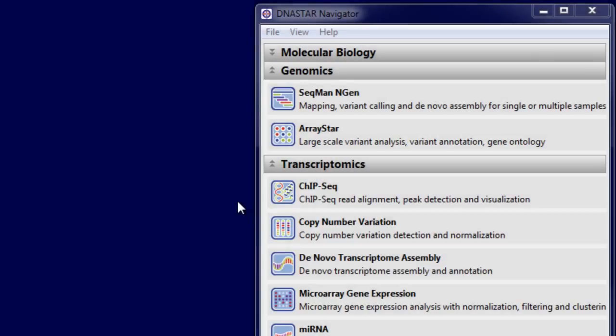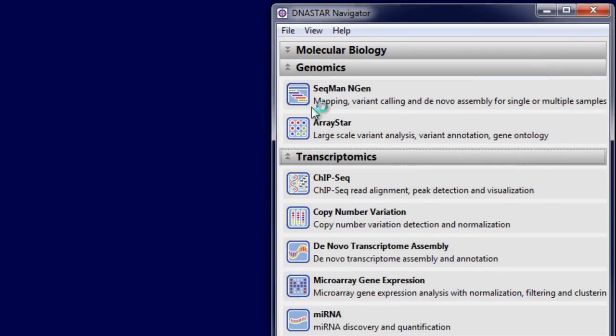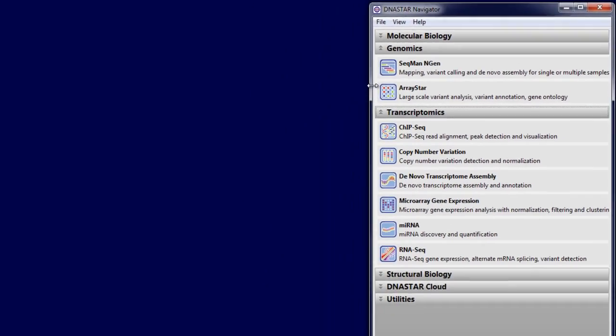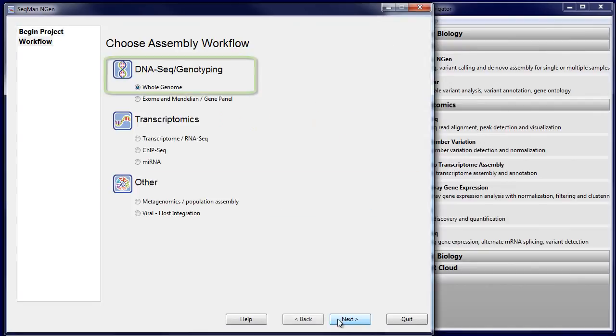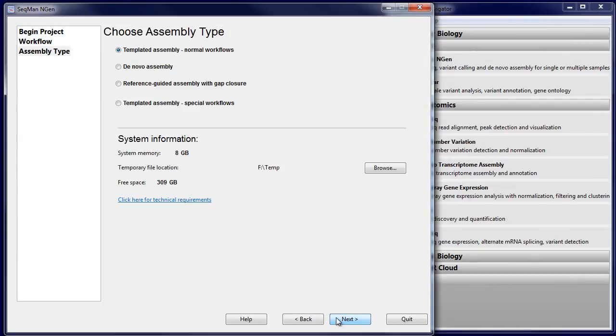To align multiple genomes in LaserGene, launch SeqManEngine, then create a new whole genome templated assembly.